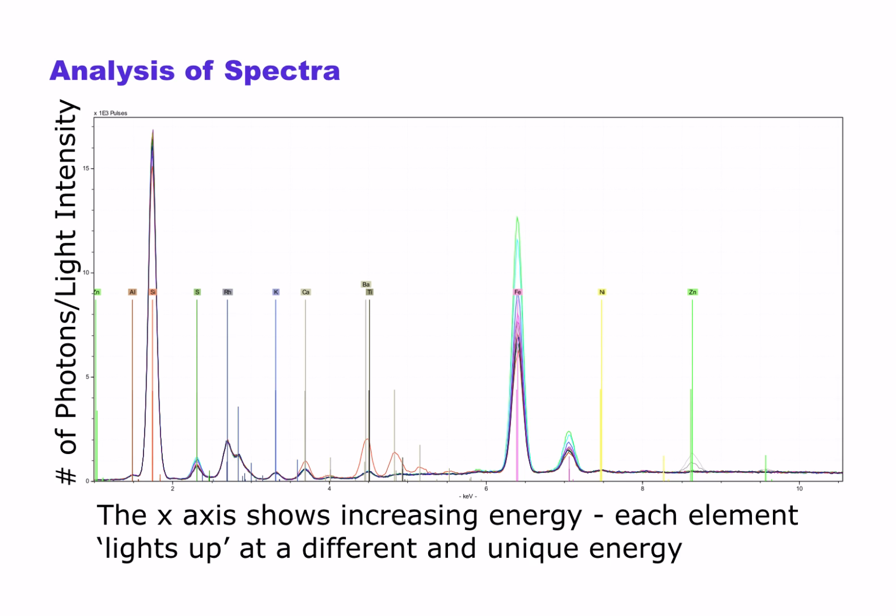If you look to the right, around 6.4 keV, you'll see the characteristic K alpha peak for iron. If you look a little further to the right, you'll see the K beta peak. You'll notice that the higher K alpha peaks also result in a higher K beta peak. As long as your sample's on the surface and homogeneous, these are always going to be at the same ratio to one another. However, if you have layering or a different matrix you have to measure through, you're going to have a larger representation of the K beta peak relative to the K alpha.